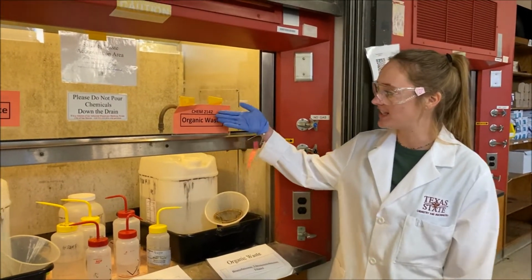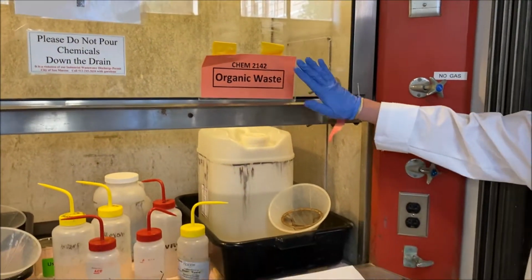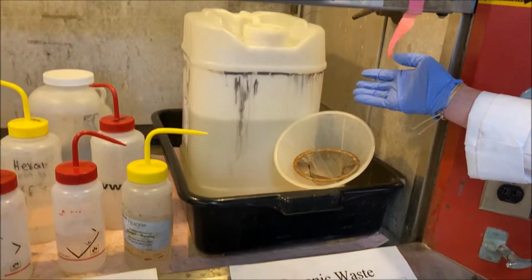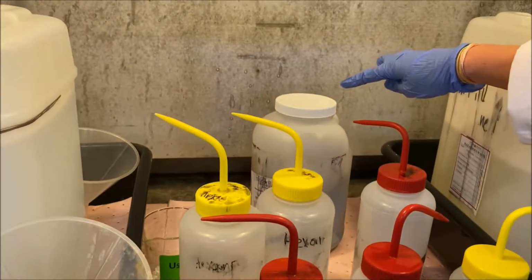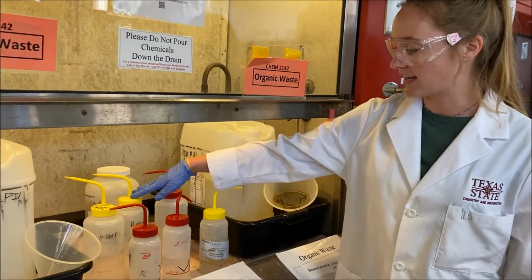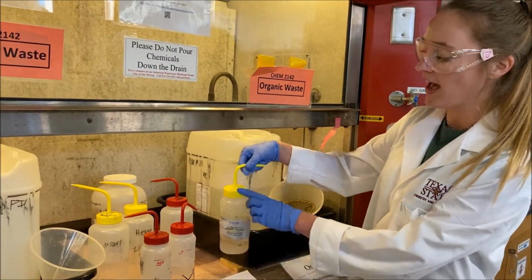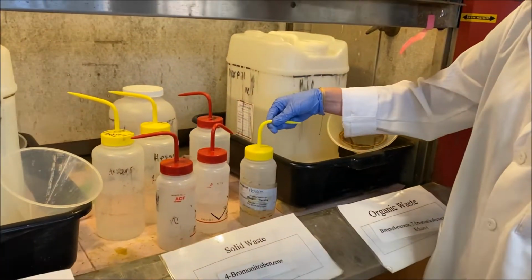So we have a similar setup in our OChem 2 lab. So as you can see here, this is our OChem 2 fume hood, and it's labeled in two places. So the organic waste is right here. Right next to it is the solid waste, which you can see right back there. Right in front of the solid waste, we have a few of our cleaning solvents. So we've got acetone and hexane. You know it's acetone because it has a red cap, and hexane has a yellow cap, and you can also read the bottle sometimes and it'll have the name on it.